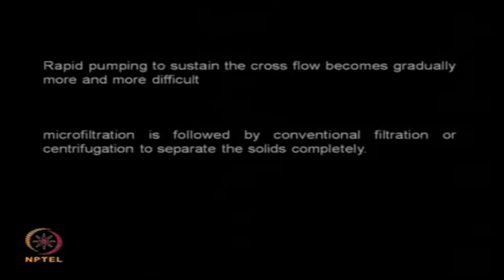So if you want to keep the rate of filtration high, we have to keep on increasing the pumping to sustain the cross flow. So sometimes we may go into microfiltration followed by conventional filtration or even centrifugation to separate the solids completely.